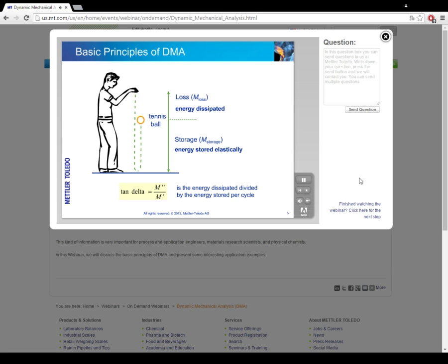If a material is completely elastic, it stores the entire mechanical energy involved in the deformation. The energy is released without loss when the deformation force no longer acts. This, for example, is the case when a steel ball bounces on a hard surface. It bounces back up to the original height. In contrast, in an ideal viscous liquid in which the molecules are free to move, no energy is stored and the energy is converted to heat. The behavior of viscoelastic materials is characterized by loss and storage components. These and other quantities can be determined by DMA measurements.